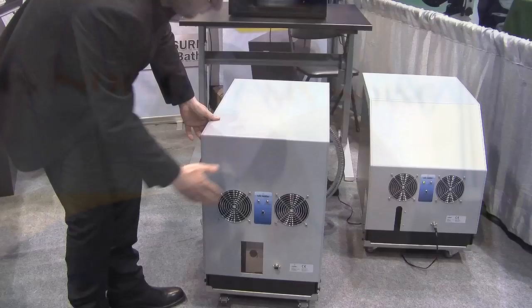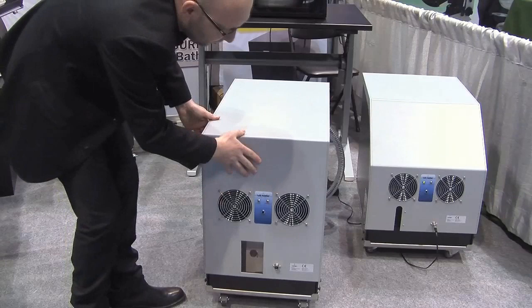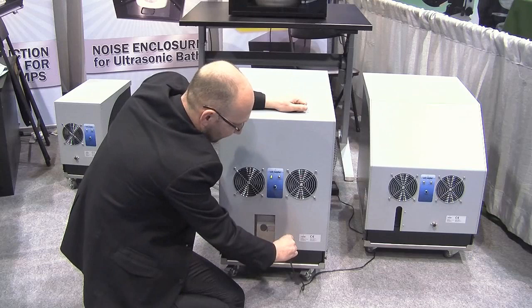You just need to put the cover on. It's ready to use — you just need to plug it in. There is a main power supply here, so the fan starts to cool the system.